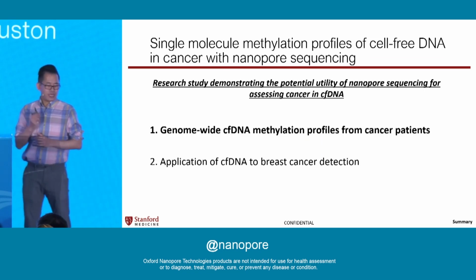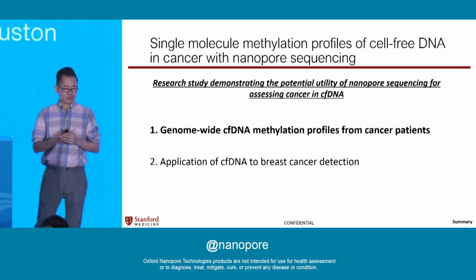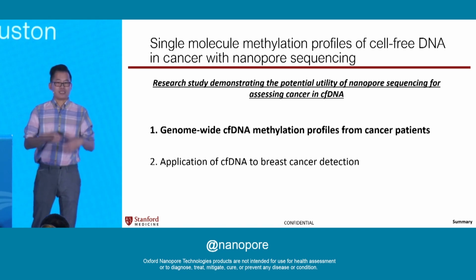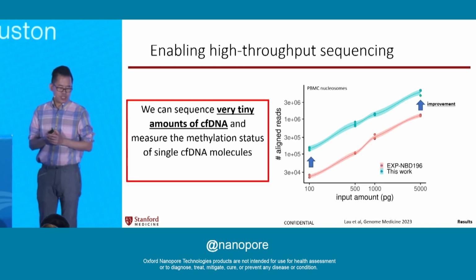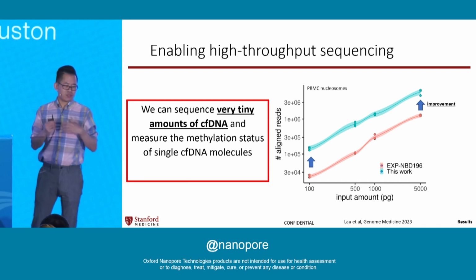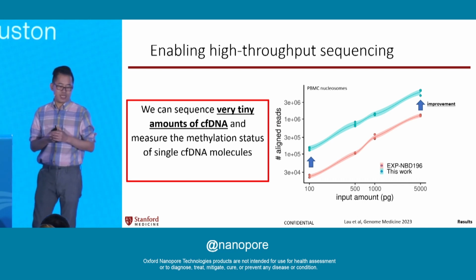So with that in mind, let's look at one of the studies that we have published very recently, about 6 months ago, where we took nanopore sequencing and applied it to cell-free DNA to see what we can ascertain from the single molecule profiles. Long story short, in this paper, we can sequence very tiny amounts of cell-free DNA and measure the methylation status of single cell-free DNA molecules.